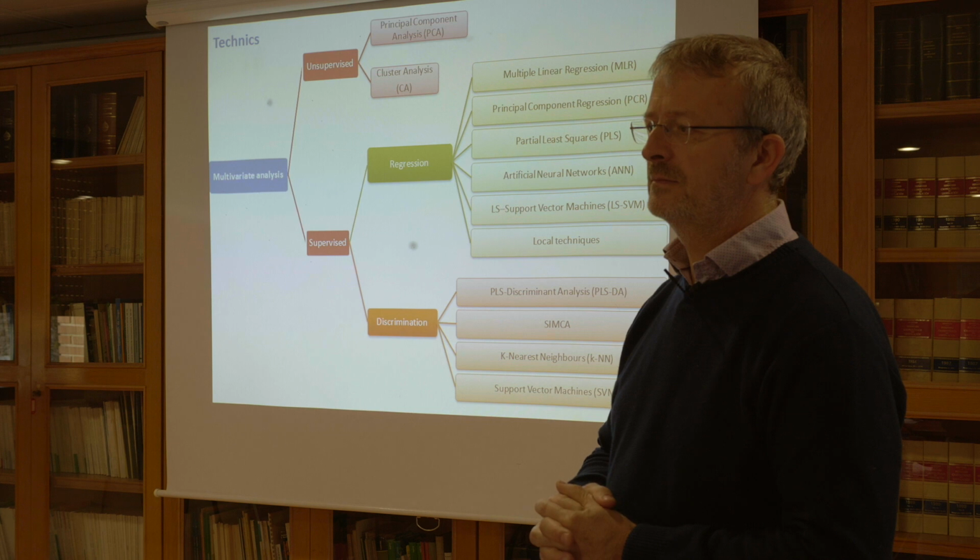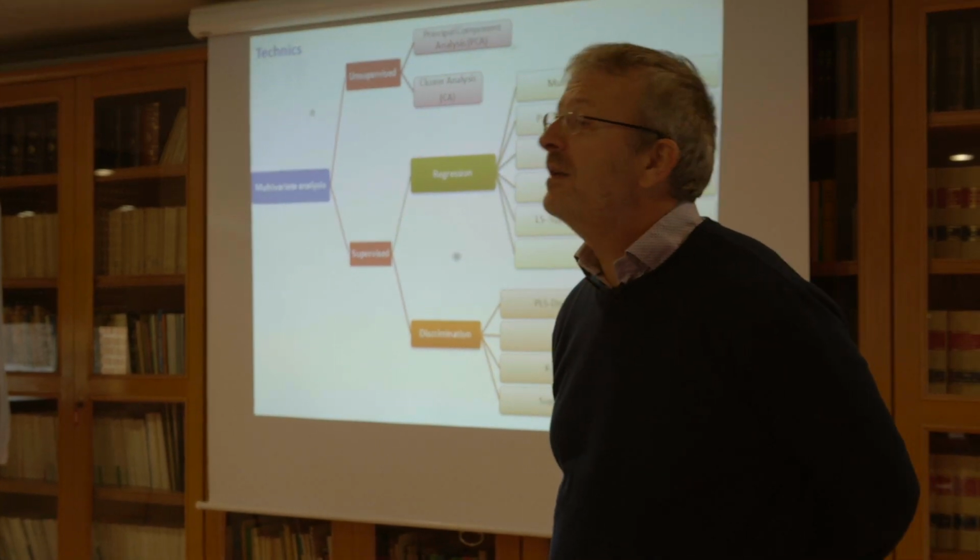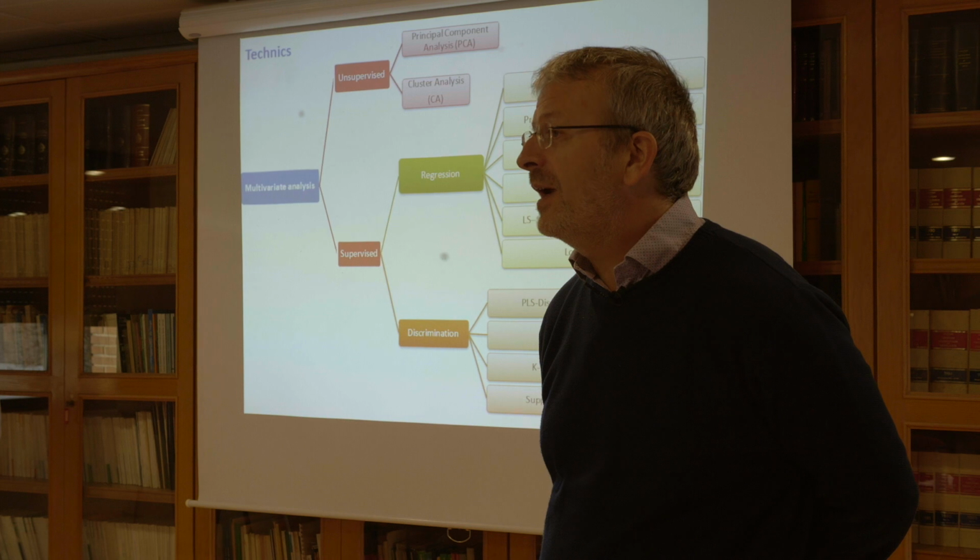Only one comment about the MIR. You say that MIR is used in milk analysis. I think it's a matter of concentration of the components that you are analyzing. In fact, in routine, you can use MIR to determine the percentage of fat and protein. But if you need to analyze very low concentrations, for example for residues or something like that, I'm not sure.